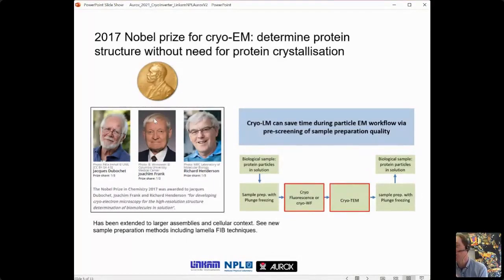You normally have particles that are all the same, so only in some experiments might you need to identify different types of particles. Still, the optical imaging is very useful here, because you can monitor your sample quality, and therefore you would not take samples to the EM and use up valuable EM time when you can do this pre-screening step.